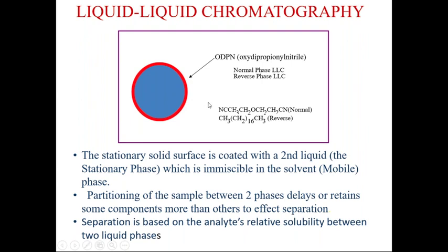The separation occurs because of the difference in the solubility and attraction of the analyte to this liquid, which I have shown in red here, and to the liquid which is passing through the column.